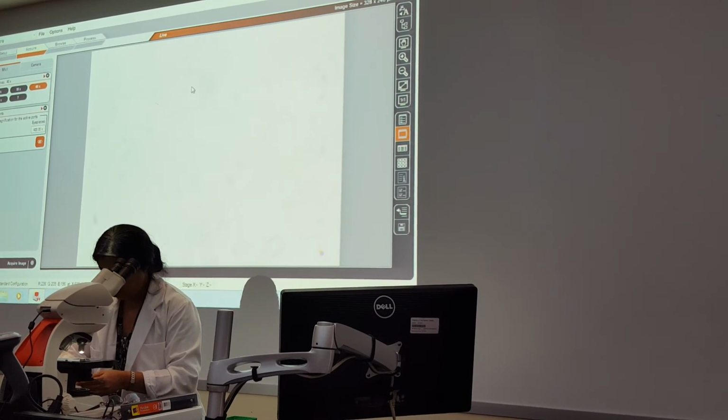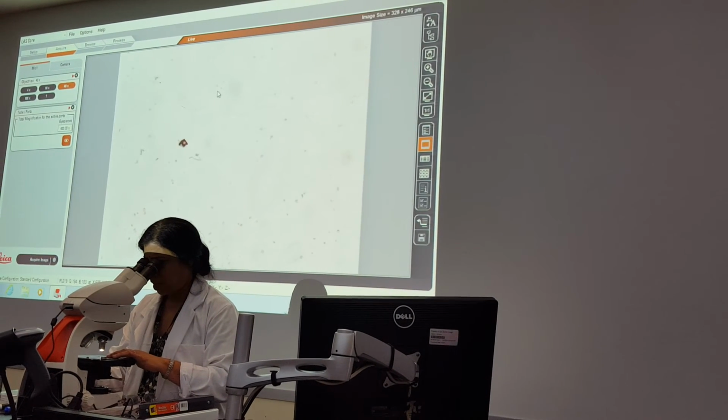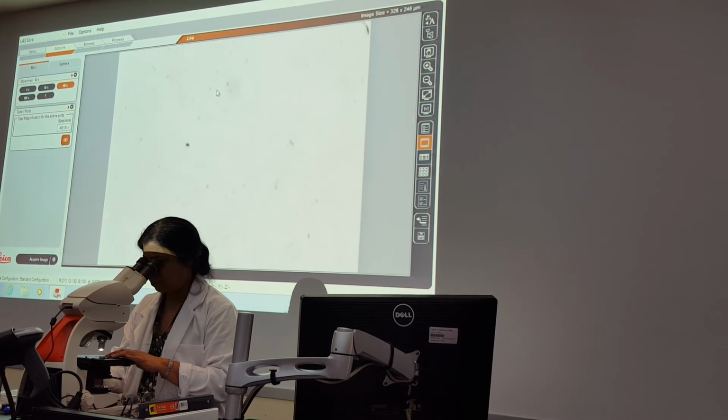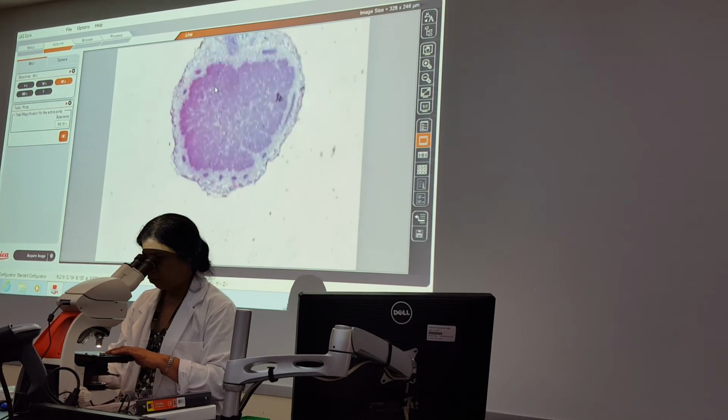Now, let me do the legume nodule because that could probably confuse most of you. I'll do the nodule and monocot and dicot we'll skip because time is up. We have to go for the lecture. Your friends will be waiting for you.